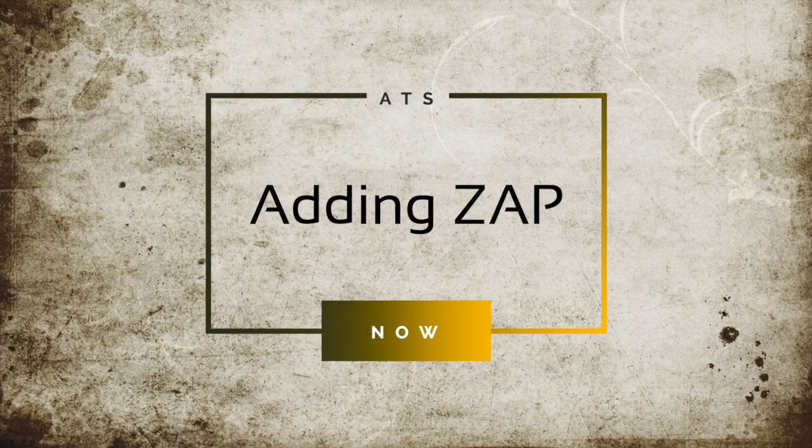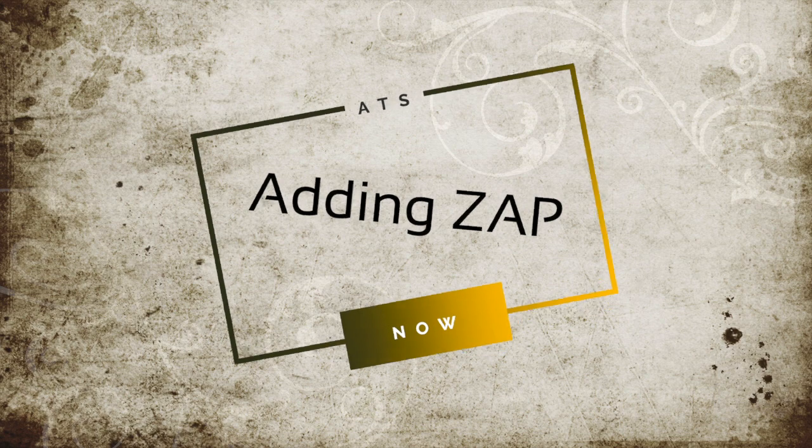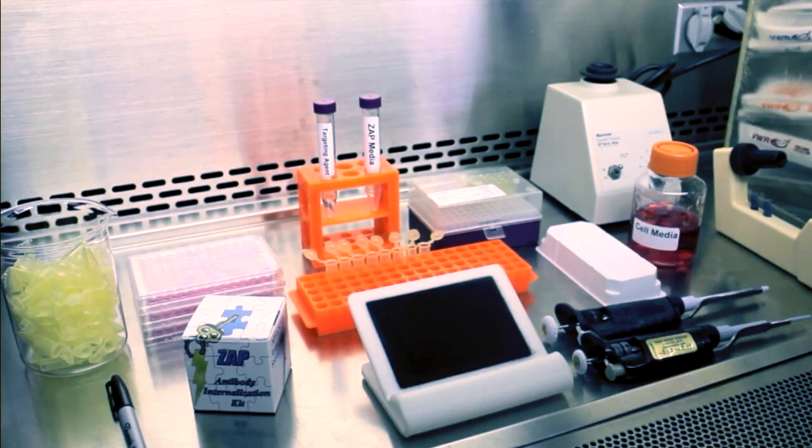This video will instruct you on how to prepare your ZAP-spiked media and targeting agent, and how to mix them together for the assay.